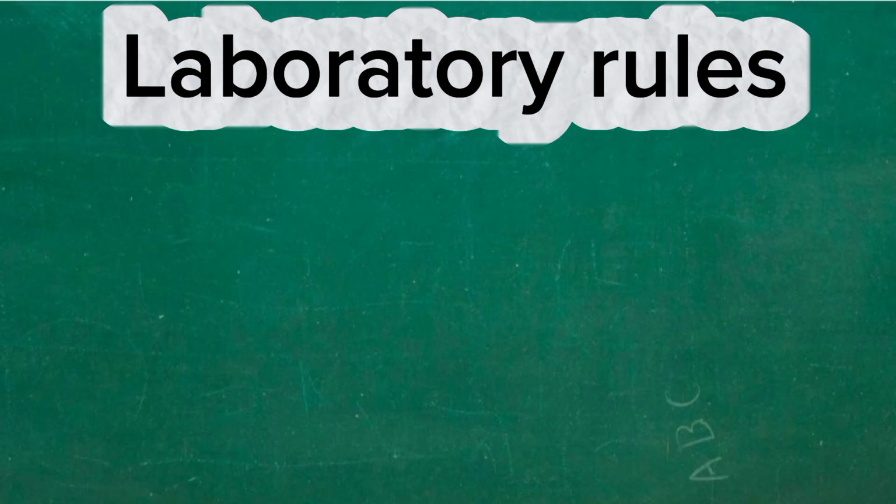Right together? So next we are going to see the laboratory rules to observe when in the laboratory. Usiende laboratory kama una laboratory rules. So these are the rules that should be observed, especially when going to the laboratory. Safety measures to observe while in the laboratory. 1, never rush into the laboratory. Instead, walk slowly and calmly.